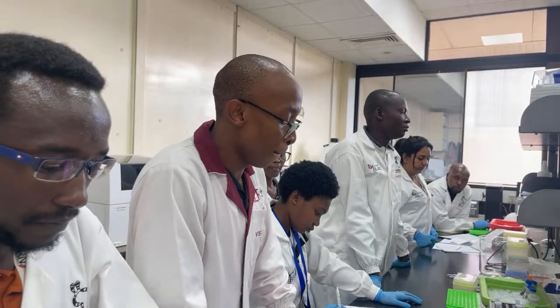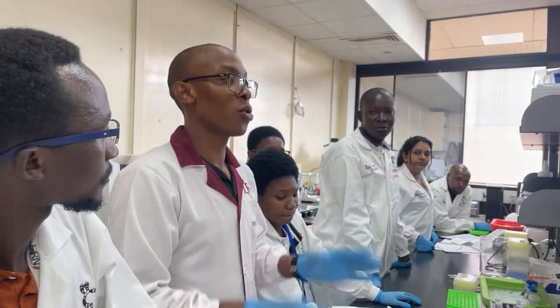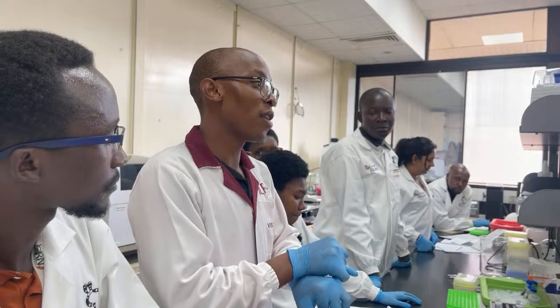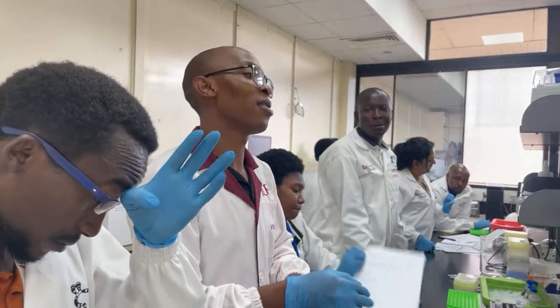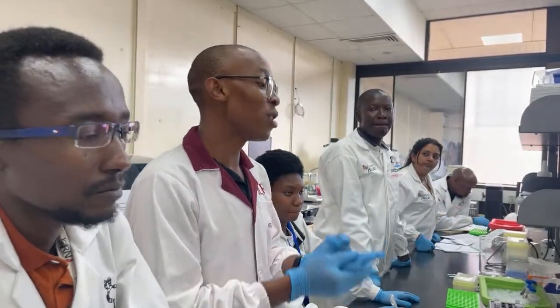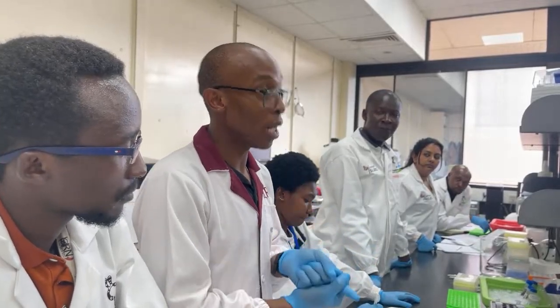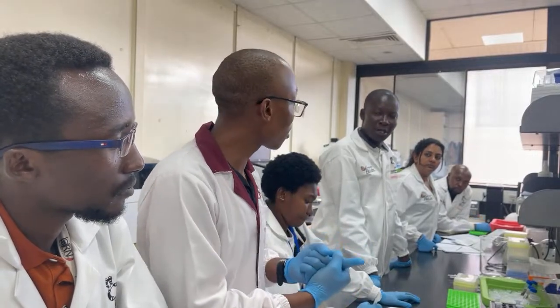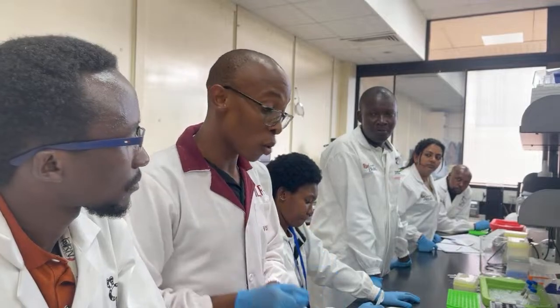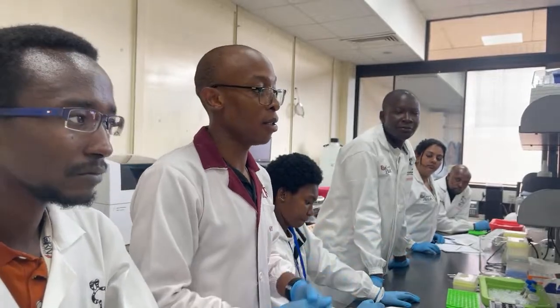Yeah. So another question. Looking into this kit, I can only see that it is optimized for animals. Is there an alternative for plants? So with Nanobind you have 3 kits. You have Nanobind Big DNA CBB. C means cell, B means blood, and the other B means bacteria. So for those 3 types of samples, you can use one kit. There's a Nanobind Big DNA Plant Nuclei that's specific for plants. And then there's Nanobind Tissue, which is what we are using. So all those things are covered in those 3 kits.